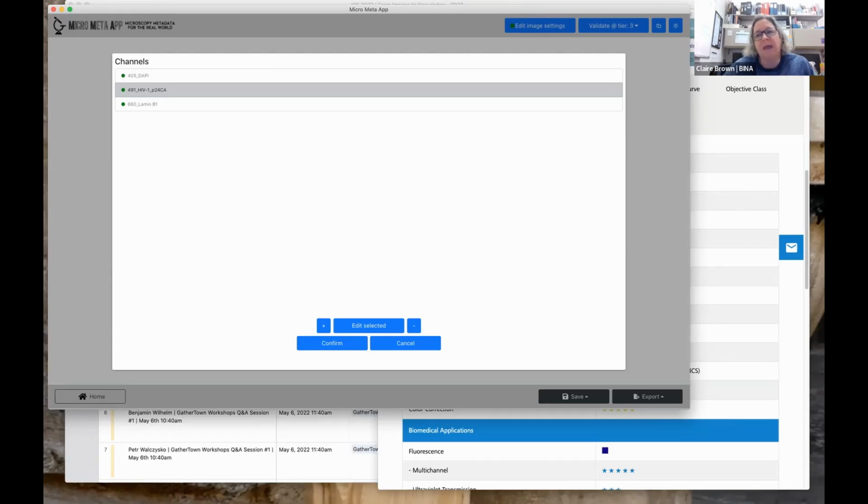I would just add, if you're talking to your microscope manufacturers, tell them, I went to this workshop, and wouldn't it be great if we could get a JSON file from Nikon? I know from working with companies for a long time that the more they hear a request, the more likely it's going to make it up the chain. If they hear it from a lot of different places about the same request, then it's going to have more likelihood of being implemented.